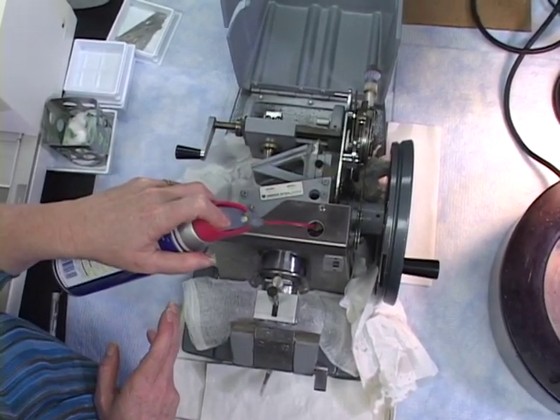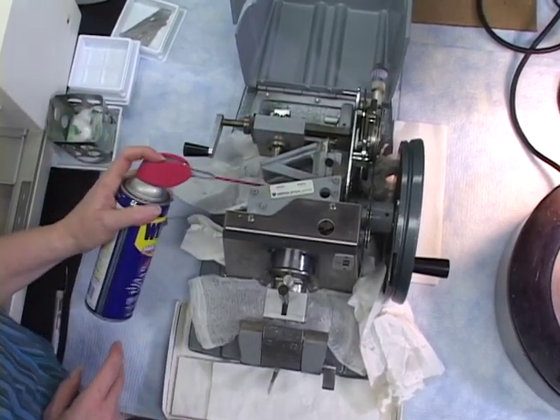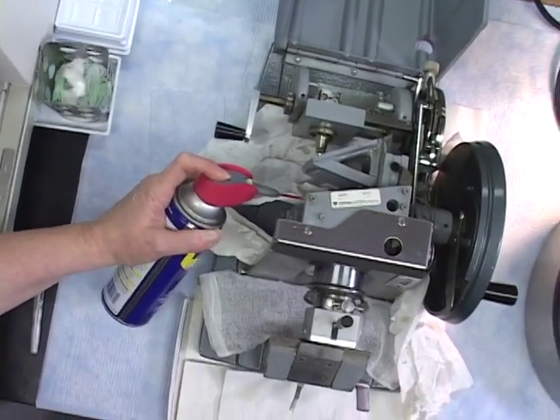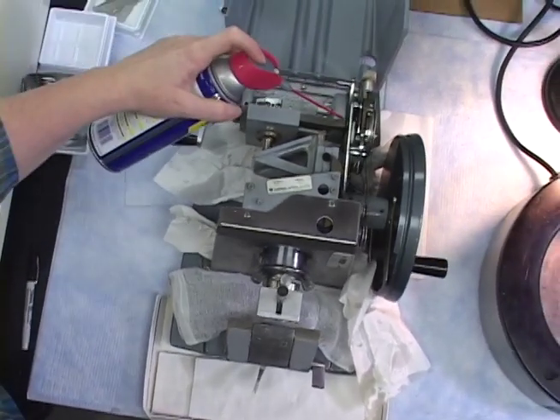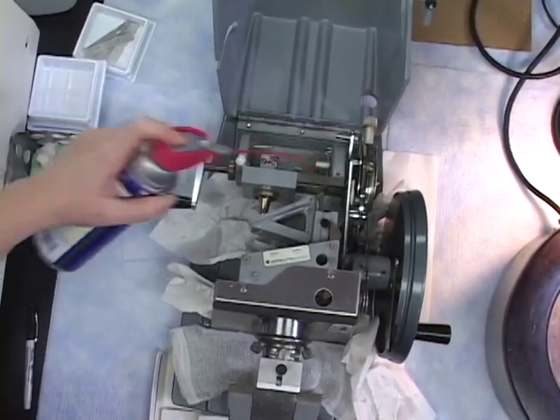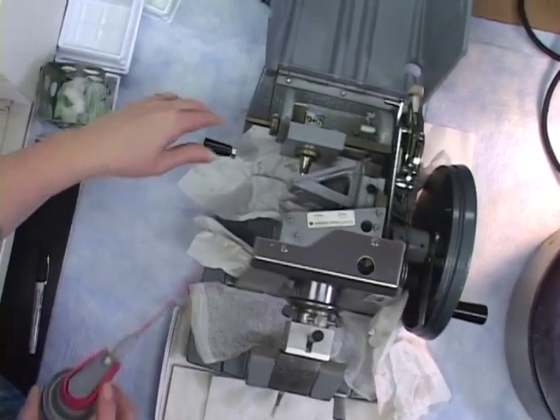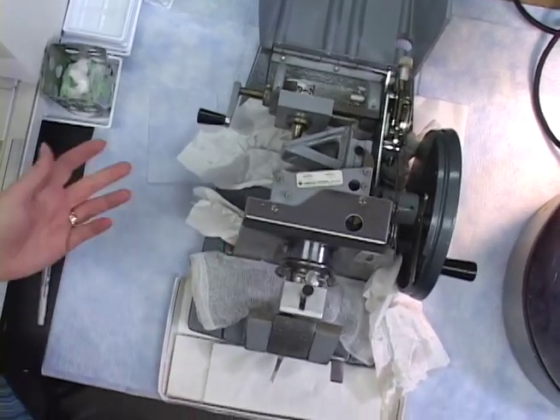I give this a squirt. There's a hole hidden underneath a spring under here, which you'll see on the paper. I give that a little squirt. There's 2 holes here, one there, one there. I give them little squirts. This is a moving part here, so I like to give that a little bit too. You get the general idea.